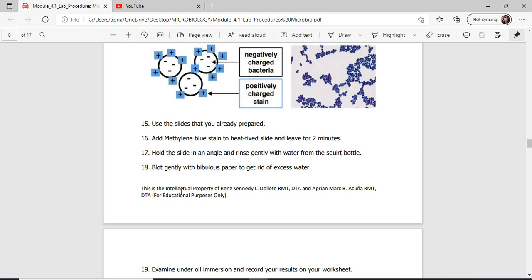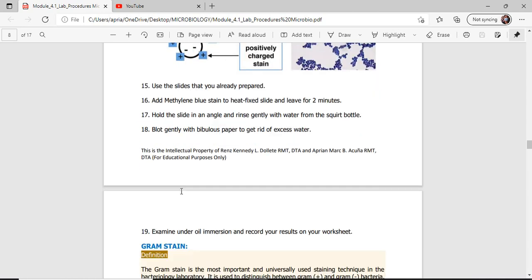Okay, amo na gali explanation aside da. Pwede ka na gamit sa mga tap water sa paghugas sa mga smears mo, because ga-wash off ang mga bacteria nga arada. Aside pa sa naga-wash off ang mga bacteria nga arada, ang imo nga smear mismo is already stained na. Bacteria mo will have a color, yung background will have a color.